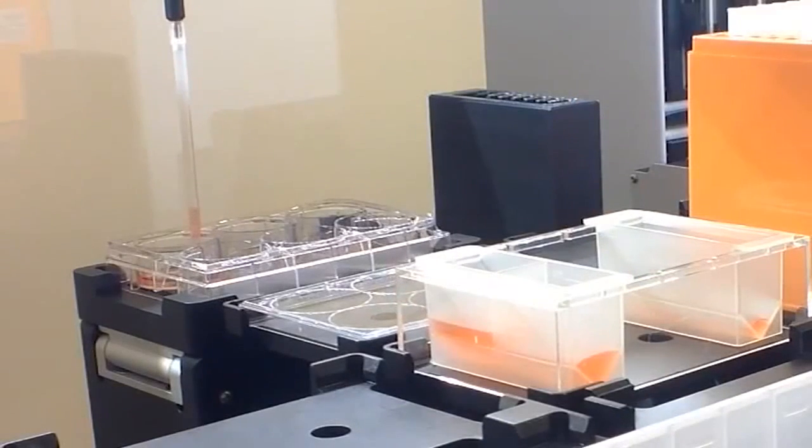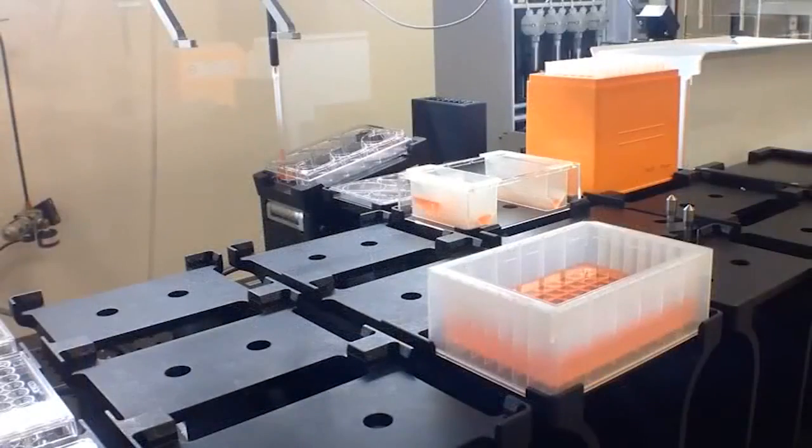We then used our optimized pipetting to pipette around the circumference of the well to make sure the cells were removed from the surface of the plate, and then also did a mixing step to ensure that the cells were distributed into a single cell suspension.